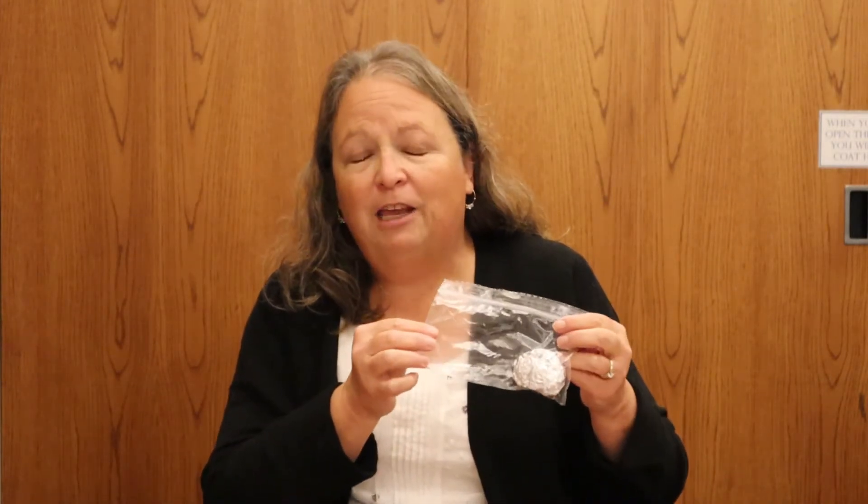Hi everybody, I'm Sandy. Welcome to Virtual STEM Club Investigative Crew. Today we're going to be dissecting owl pellets. If you don't know what an owl pellet is, it's the parts of the food an owl has eaten that it can't digest, and then they spit it back out. Let's have some fun.